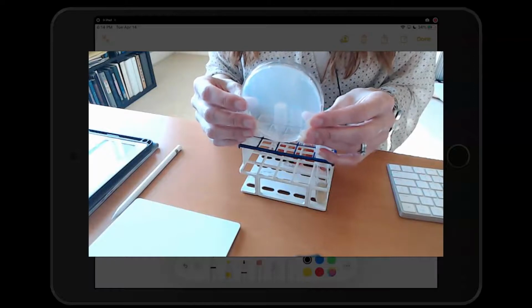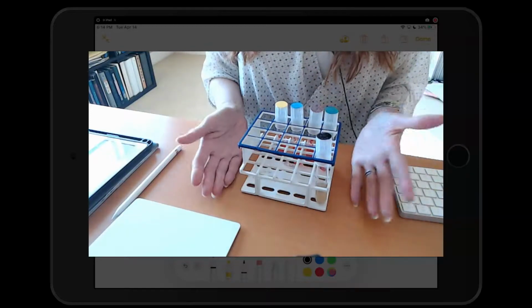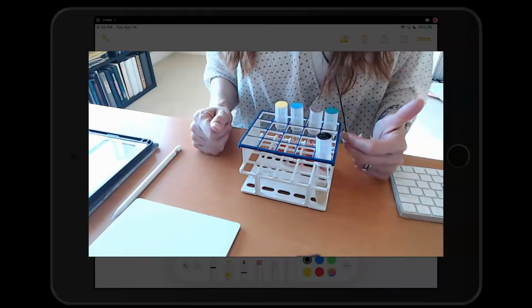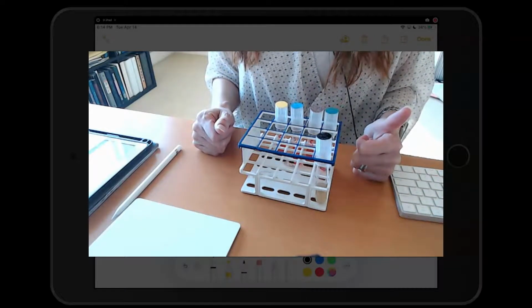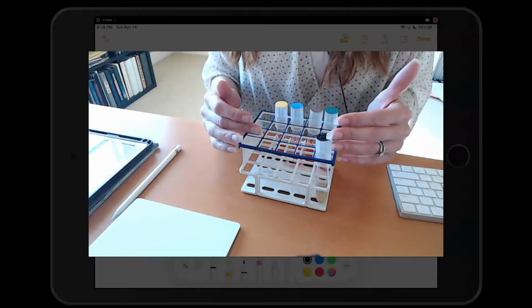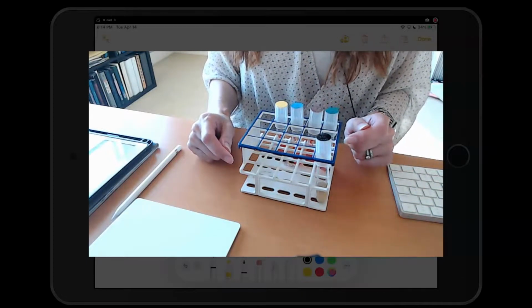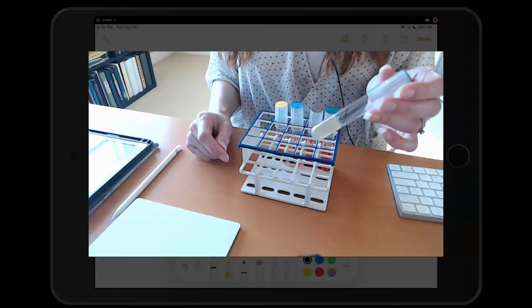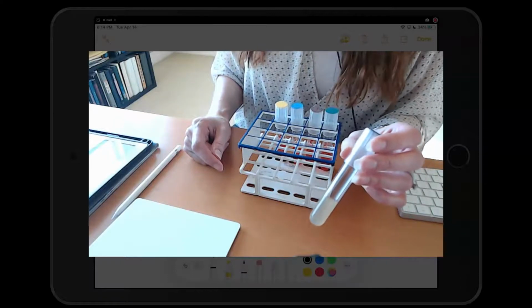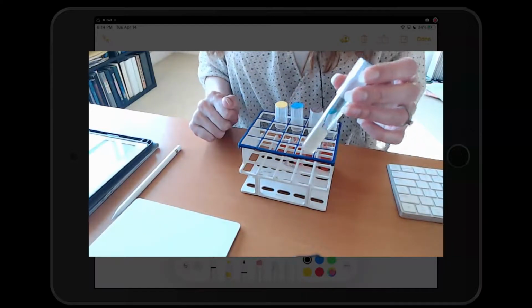So what are gelatinase and amylase? These are 2 different types of exoenzymes. Some bacteria are going to produce these exoenzymes. Exoenzymes are enzymes that are made inside of the cell and then secreted to its environment to break down different things. In the case of our gelatinase enzyme, some bacteria will produce gelatinase, which is an enzyme. Remember, they both end with ase, amylase, gelatinase. So gelatinase would be an exoenzyme that the bacteria produces inside of the cell to be secreted to the outside.